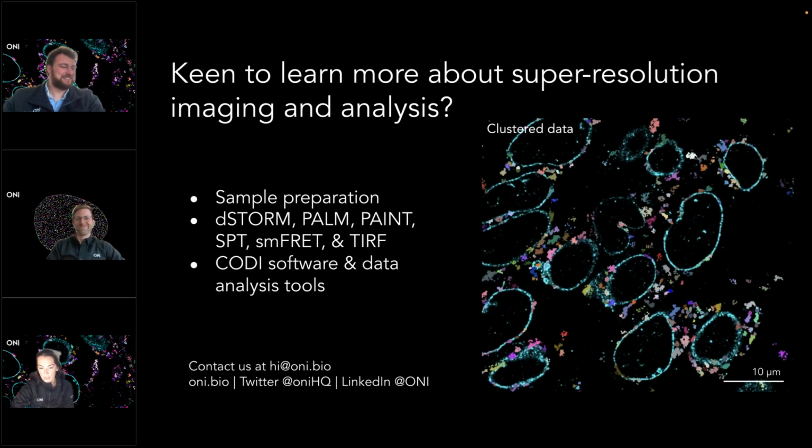All right, a few more questions coming in. Would temporal grouping be able to provide data on time or dark time for downstream analysis in DNA-PAINT? Yes. I don't think we have a tool for this on CODI yet, but we have been writing some in-house tools at the moment. Right now, I think we just have them as Python scripts, but they will soon appear on CODI.